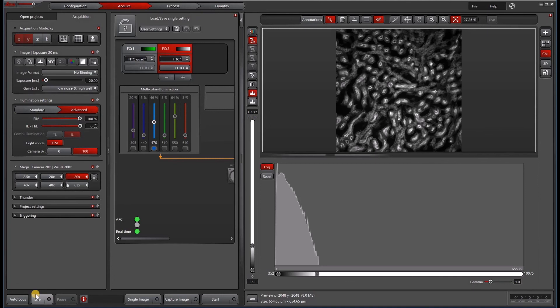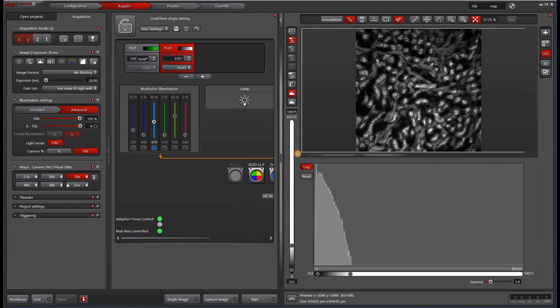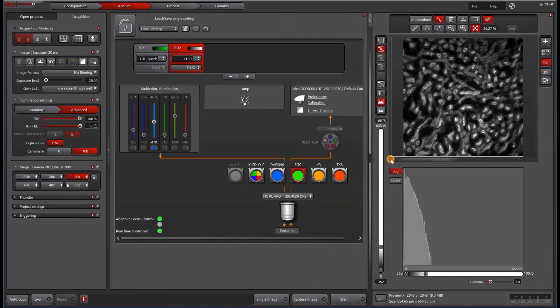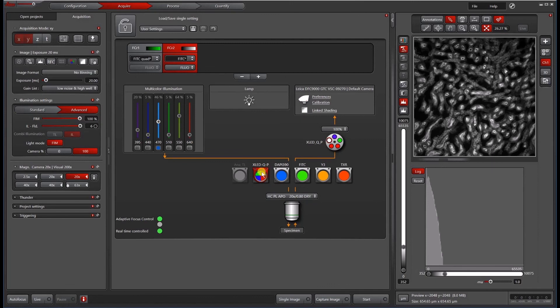If you were doing a multi-channel acquisition, this external filter wheel with the quad cube, this combination saves you a lot of time. And that is the reason why this quad cube is used as opposed to the single filters.